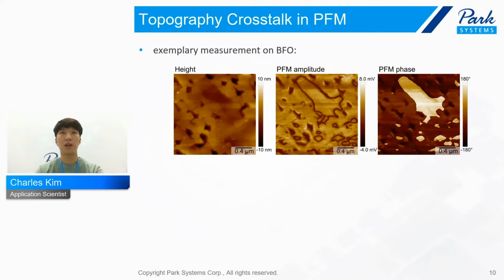In this slide, I want to talk about the topography crosstalk. As you can see, in the height image, you can find many holes here. This sample is not flat, but has many holes. And from the PFM image, you can see very clearly the domain boundary here. Somewhere has small grains, somewhere has big grains.